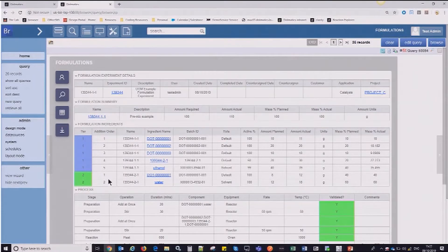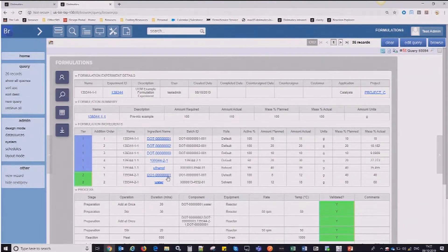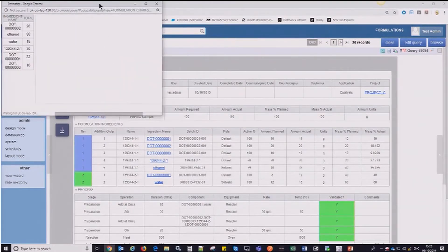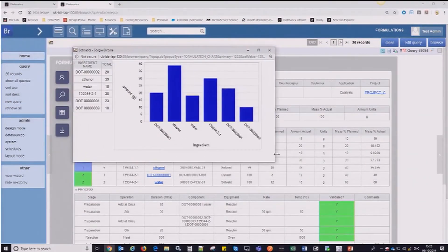We've got a really nice representation here of a tiered structure, so if you are using the concept of a premix or a formulation within a formulation, that's nicely highlighted here in this particular example where you can see the two ingredients at the bottom have been combined and then used in the tier above. This is really nicely demonstrated when you're using the same ingredient in two tiers. I can show a nice chart that flattens the structure of the formulation so that you can see for ingredient 0001 that it's combined and calculated the total amount of that ingredient in this particular formulation.